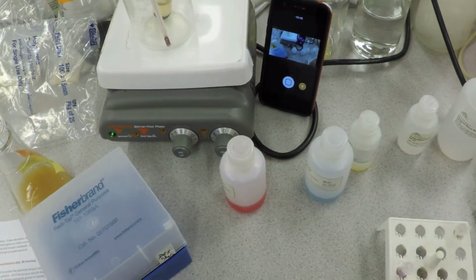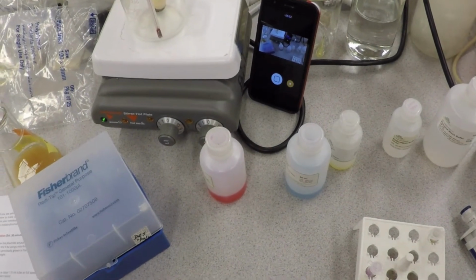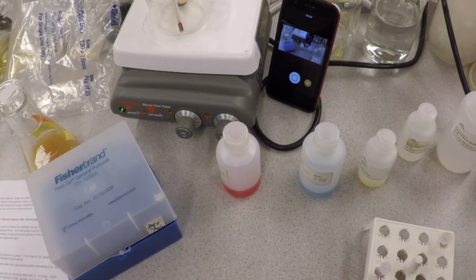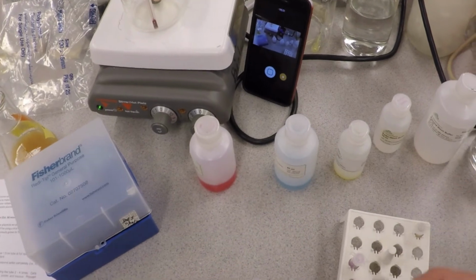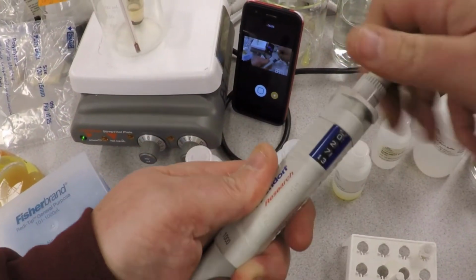Okay. Now it says add 400 of P3 buffer, which is the yellow buffer, which is right here. And it says do not vortex. Okay, mix gently but thoroughly. That means invert it a few times. Okay, so we'll go to 400 microliters.